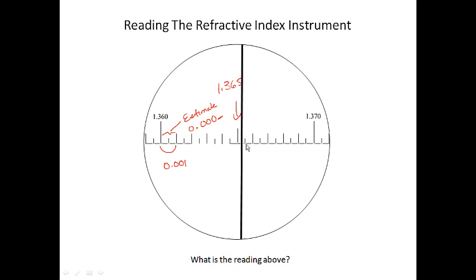If we do that here, we know that this sample has a measurement of 1.365, and between here and here is 10 units. So I would say that the measurement here is 1.365, and I would call it 3, but I'd give you anywhere from 1.3652 to 1.3654. That's how you would make the measurement. All right, you want to try another one? Here, let me take this line, not drawing it very straight. What would be the measurement right there? Stop the tape, make your measurement.